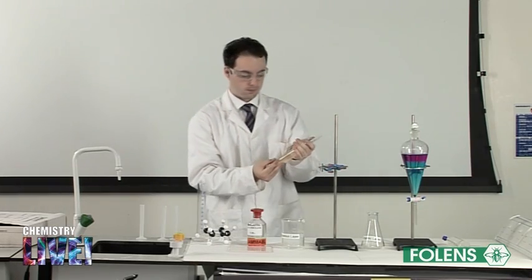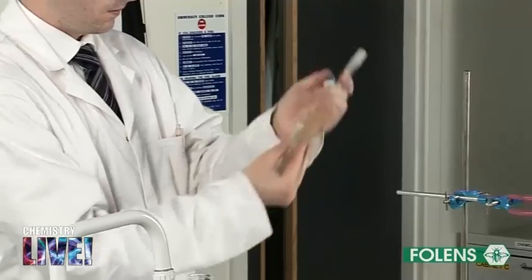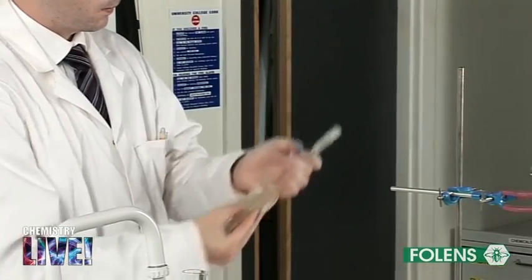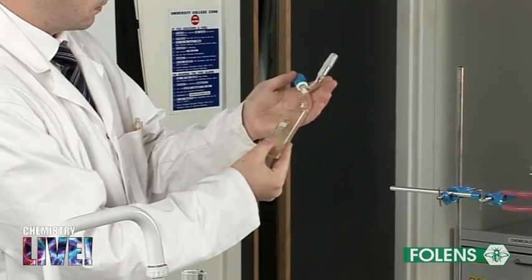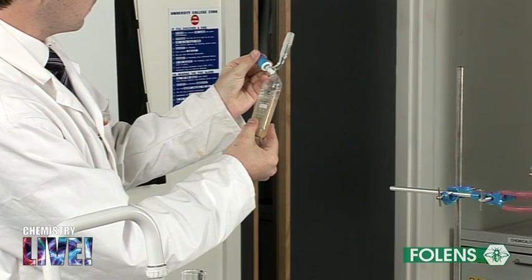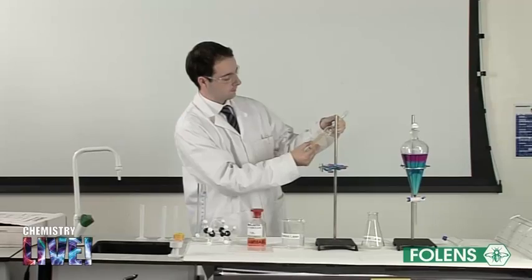Note that as each washing is carried out, the emulsion becomes less milky. The milky colour is caused by the tiny droplets of oil dispersed throughout the water. The emulsion becomes less milky because the oil is being extracted from the emulsion by dissolving this oil in cyclohexane.